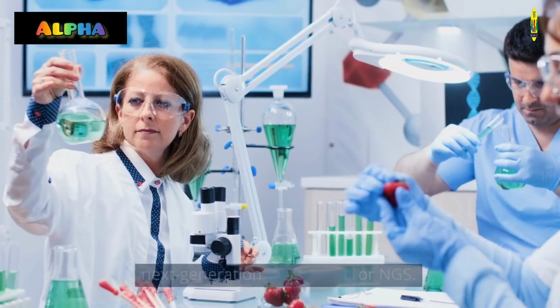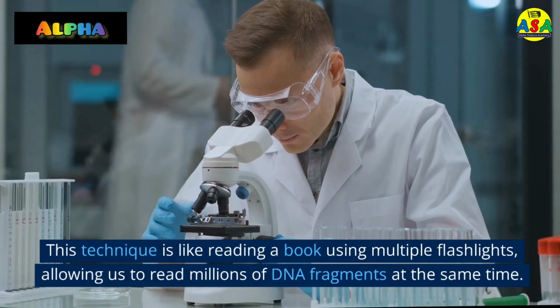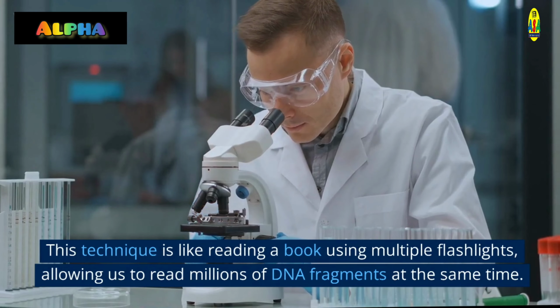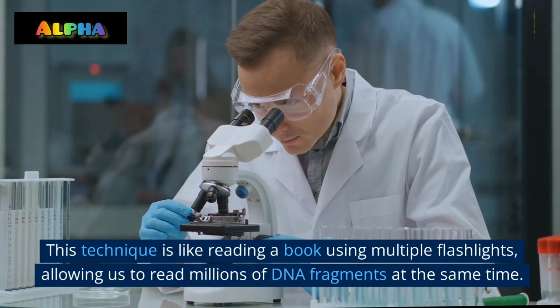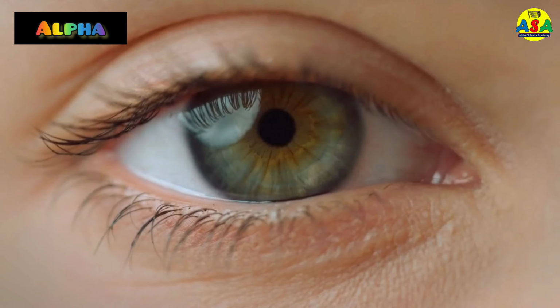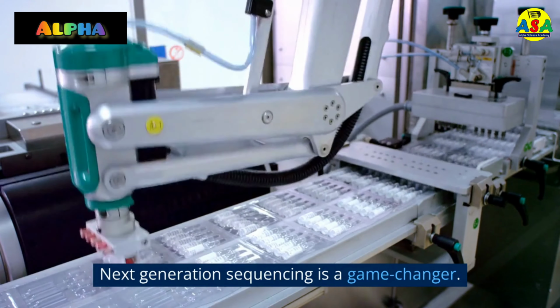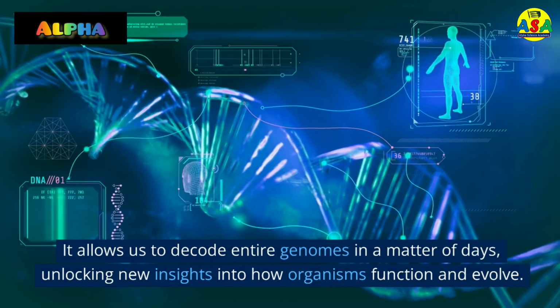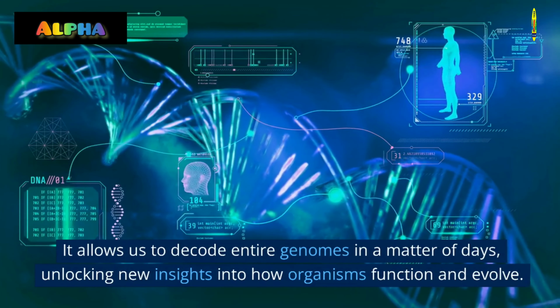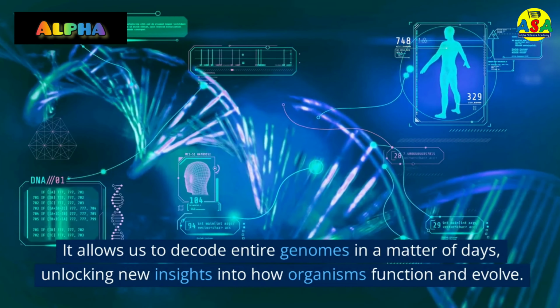Today, we have a faster and more affordable technique called next-generation sequencing, or NGS. This technique is like reading a book using multiple flashlights, allowing us to read millions of DNA fragments at the same time. Next-generation sequencing is a game-changer. It allows us to decode entire genomes in a matter of days, unlocking new insights into how organisms function and evolve.